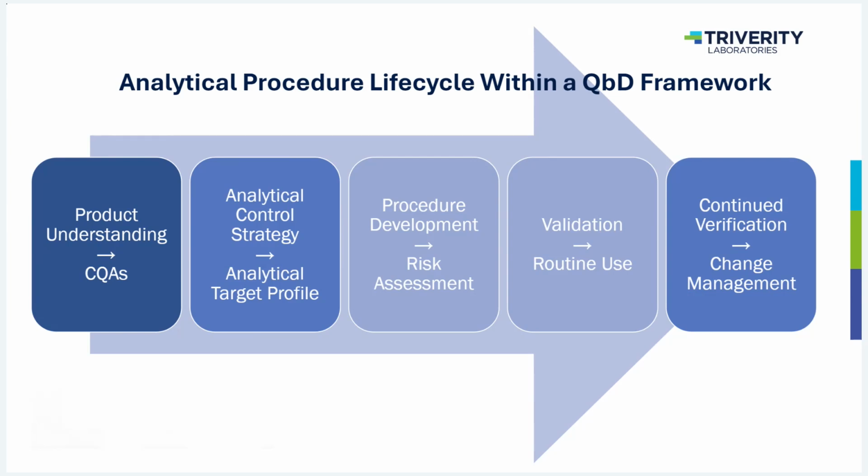And from there, we can develop the method, do our risk assessments, move into validation and routine use, and then we go into lifecycle management. That's where we are looking at our system suitability, any changes that we need to make to the method, reviewing revalidation, all of that kind of stuff.